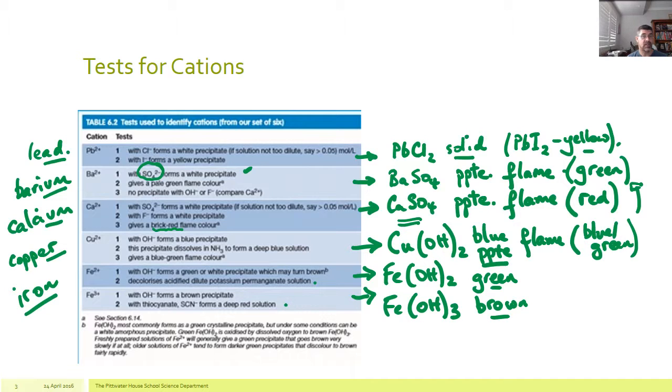Adding a chloride, so sodium chloride is a simple solution we can add to provide the presence of chloride ions. And again, remember that it's the group 1 metals that are almost entirely soluble, and so therefore they're not going to participate in the reaction. They're going to remain as spectators. And sometimes acid solutions are also chosen because, again, the H+ ion is going to remain in the solution, may change the pH a little, but it's not going to participate in any precipitation reactions, and therefore any precipitates that we form are going to be a consequence of the anion part of the acid reacting with a particular cation that hopefully we're testing for.